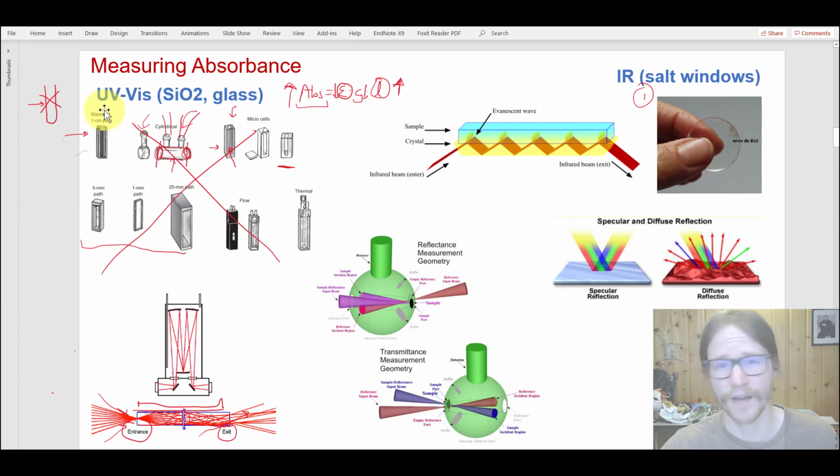And so what we do, and we have this capacity at CC, is we take a little vise and pour a little bit of clean KBr powder into it, and then we crank it down, and if we put enough pressure, we'll actually force all of the ionic bonds to align in a certain way, and we do this process called vitrifying the salt. Vitrifying comes from the word for glass or transparent, and so we end up making what looks like a glass window, but it's actually made of a salt.